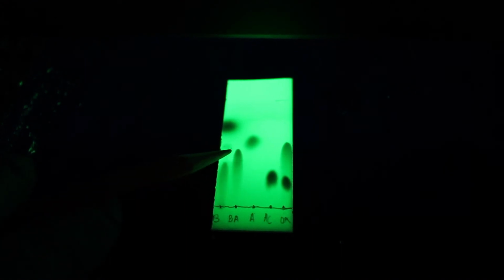Okay, so this is our most challenging plate here. This is our plate with our 4 reference standards and our unknown sample. So just going from left to right, this left lane, remember, is the benzaldehyde, so it has these 2 impurities, which are not a big deal. The main thing is that the benzaldehyde spot is right here. Then we have our benzoic acid, which remember streaks on the plate. And then we have our aniline, which is showing up here, in the middle lane.